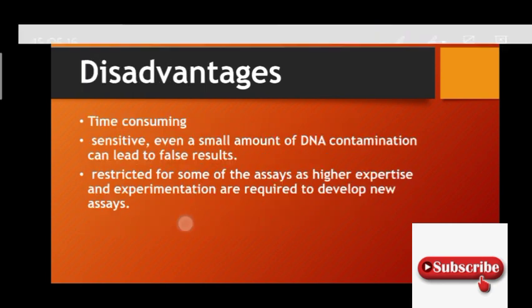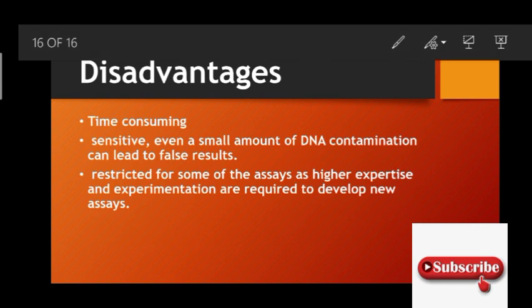And it also has disadvantages. The method is extremely sensitive. Even a small amount of DNA contamination can lead to a false result. The method is restricted for some assays, as higher expertise and experimentation are required to develop new assays.